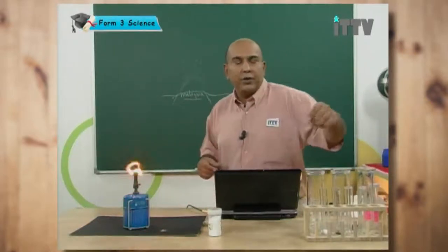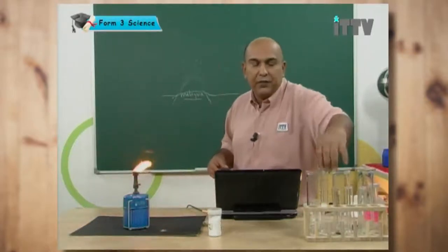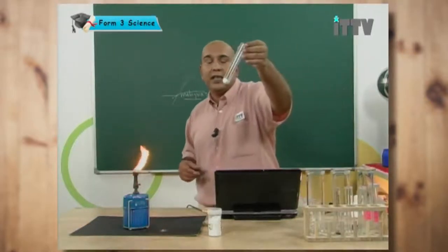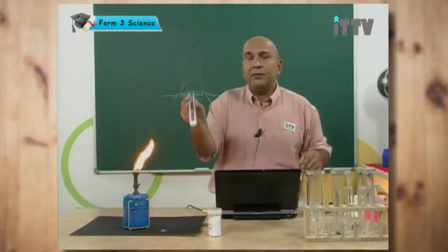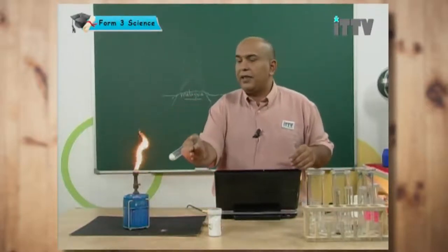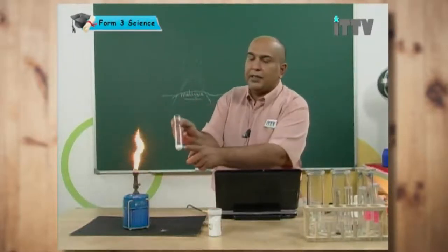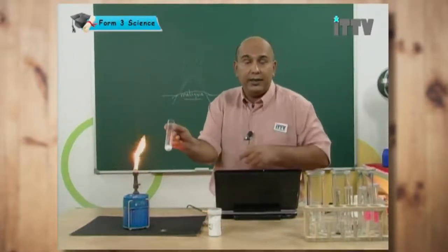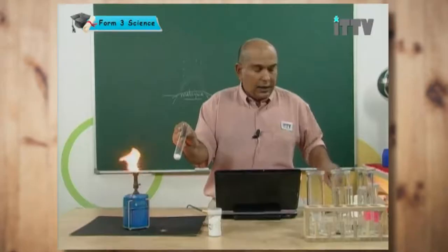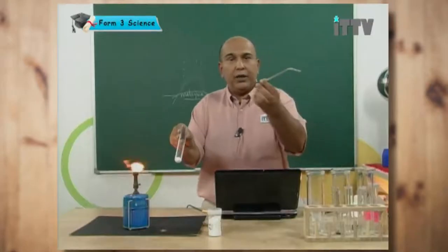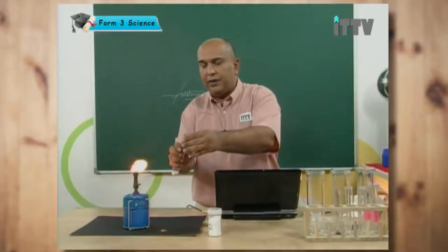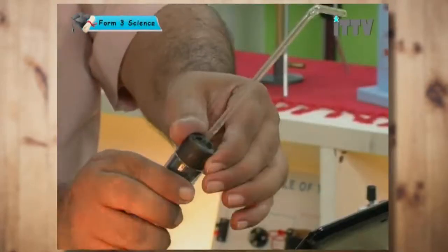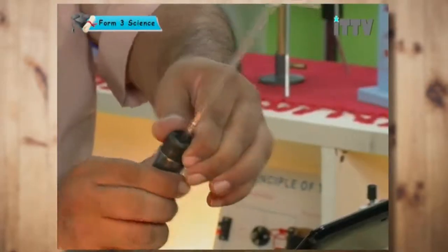What we're going to do is we're going to heat up, firstly, some calcium carbonate. I've put some calcium carbonate inside a test tube already. I'm just going to put a delivery tube on top of it, like so.